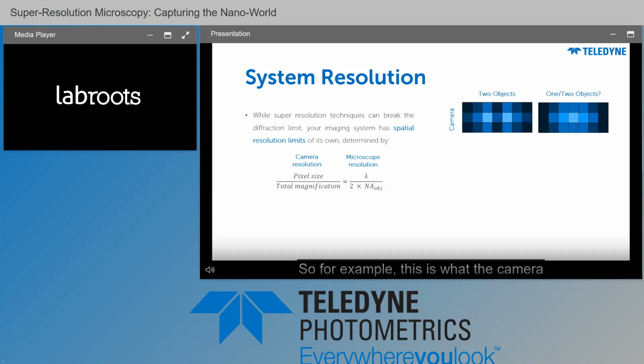So for example, this is what the camera sensor would see for two objects. You can see here that you've clearly defined between two objects, your resolution is high enough, and you can see them separately between the camera pixels. With the example on the right, we can't tell if this is one or two objects. This is at the Rayleigh limit. Essentially, the camera is too low resolution to pick out any detail here. The pixel size is likely too large.